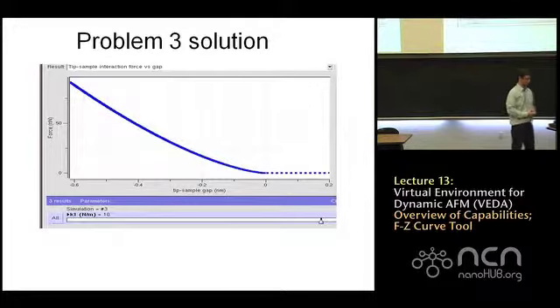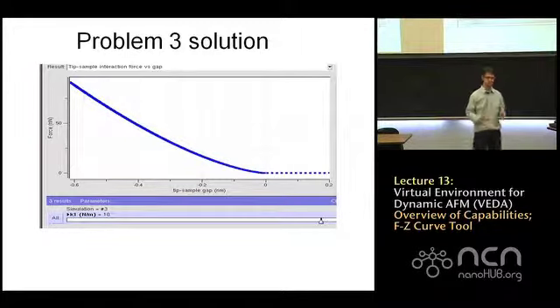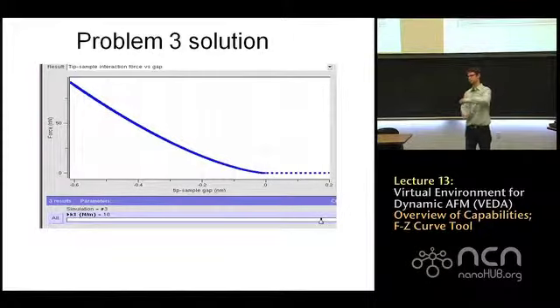You might think that to do the force distance curve, we want the softest cantilever, the most sensitive cantilever. But because of practical limitations like the Z actuation, we want a cantilever which has a similar stiffness to the sample that we're measuring. That's how it works out at the end of the day: you want your cantilever to have a somewhat similar stiffness to the sample. That's because of the combination of the measurement errors and the limitations on the Z actuation of the piezo. Okay?